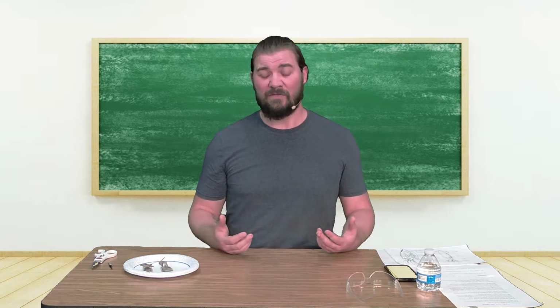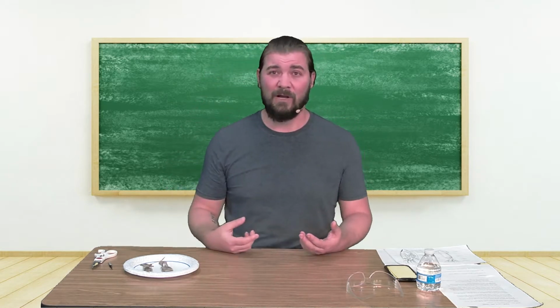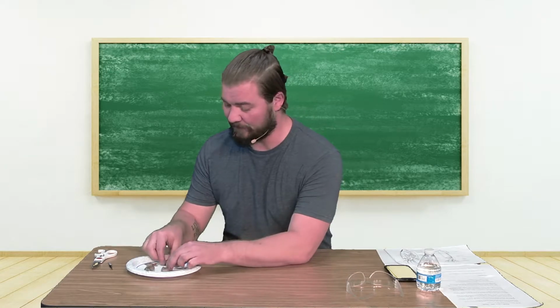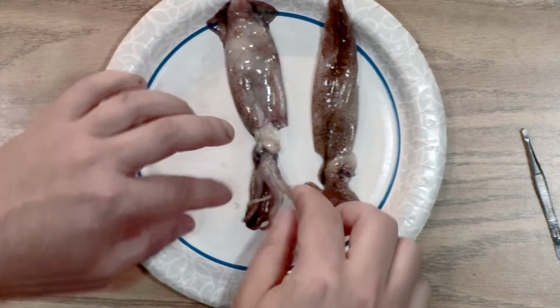That's incredible. That'd be like shooting up out of the water and almost touching the rim on a basketball hoop. That's pretty amazing for something that's underwater. So now looking back at this squid, we've seen the siphon there, and we move down.